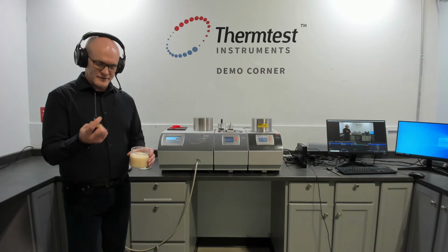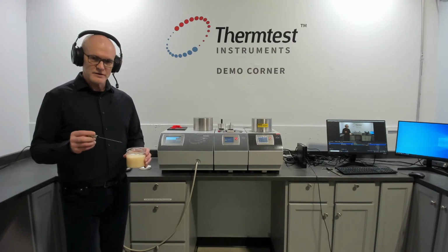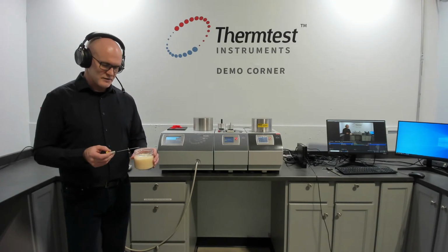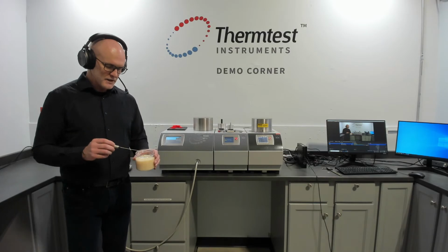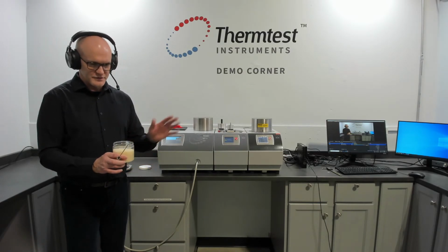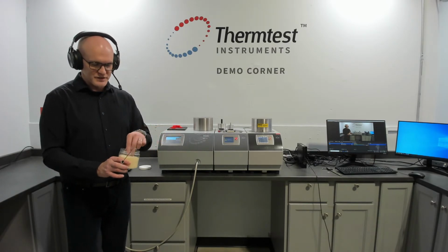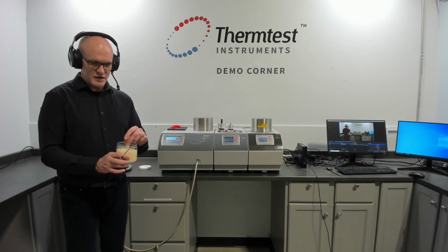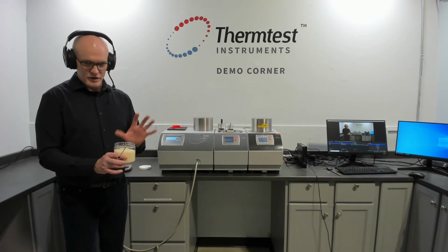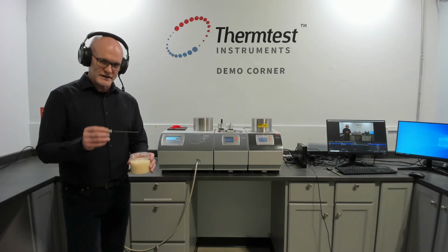So this is a needle. This is one of our needles. We make the transient line source. Following ASTM 5930, these pellets would be set up with a needle, and with temperature, they would be brought to a melt, and using pressure and temperature, the ideal situation would be this would be turned from a bulk solid to a solid, and all the air removed. That's actually quite challenging and quite messy and quite inconvenient.